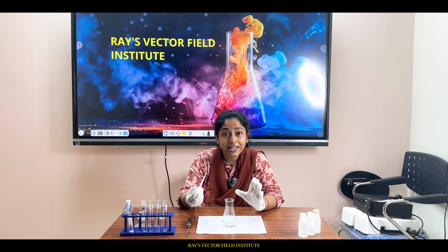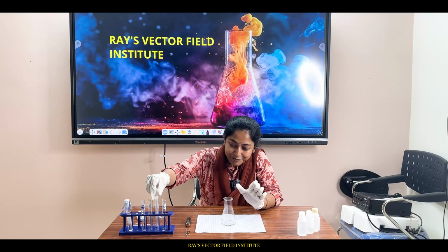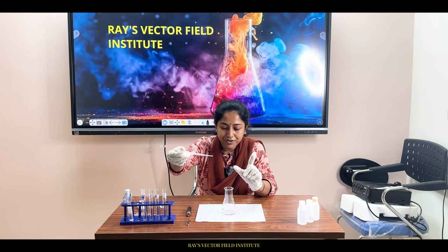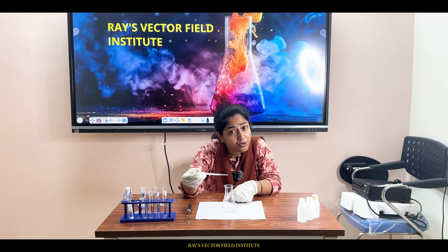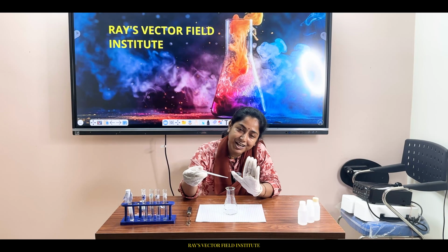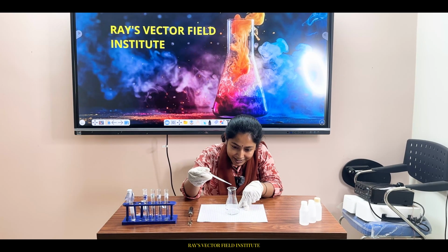Now here will be the beginning of the drama of acid base titration. I have taken a few amount of Y sample in the dropper, and I will be adding it slowly, drop wise, into this mixture of chemicals. What will be happening in the chemical reaction, I will discuss with you in the video. So be with me and be focused. Let's begin, drop wise.